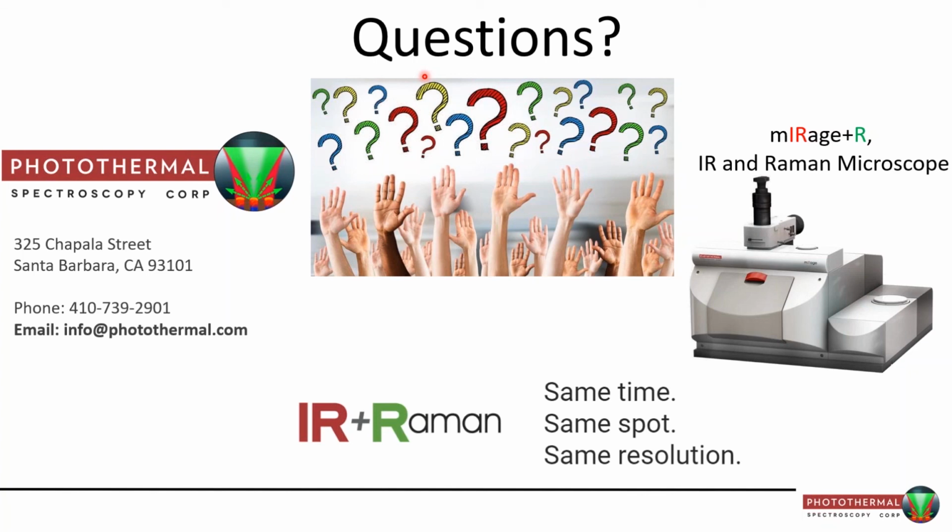So it's not really slowed us down at all, which we were pretty excited about, and we're still getting the same quality of Raman spectra.